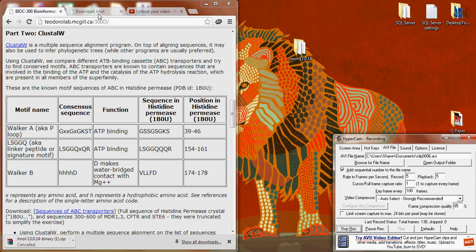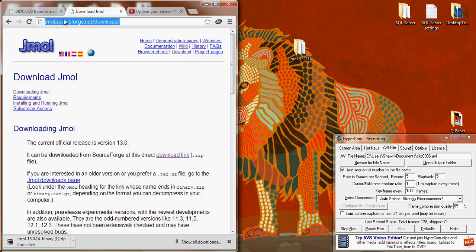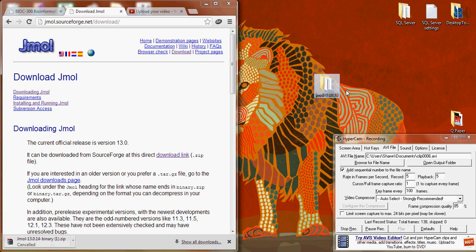You can go to jmol.sourceforge.net/download. From this you can follow the download link and download the zip file, which if you unpack that onto your desktop will give you the following folder.